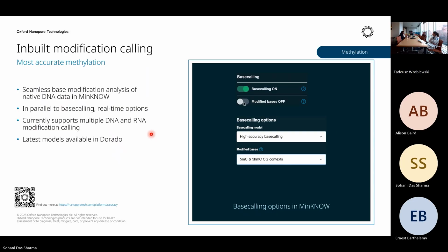Okay. So you can rerun, and as you mentioned, because yesterday we did not do the base calling with modifications, I checked it. If we want to do post-run base calling, at that time you can do base modification calling as well. Right. So we have to save the squiggle, and if I forget to do something, I can do it later. You can just re-base call.